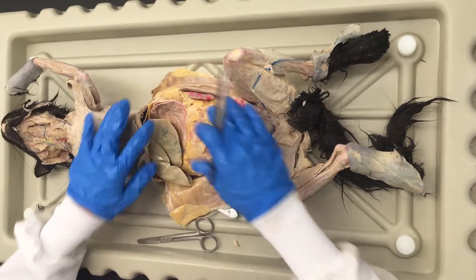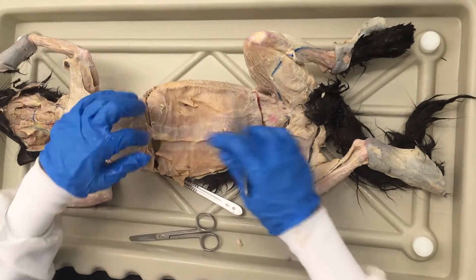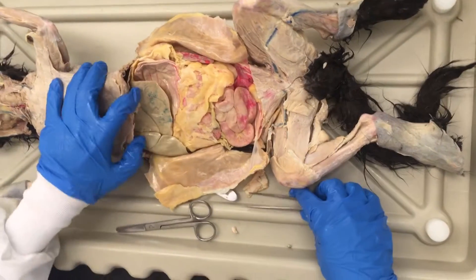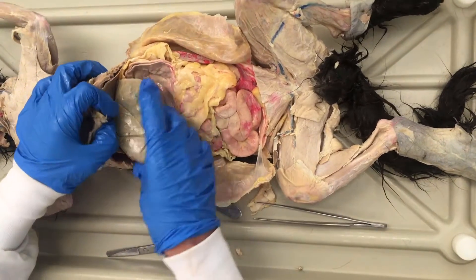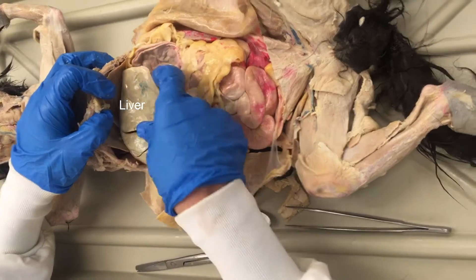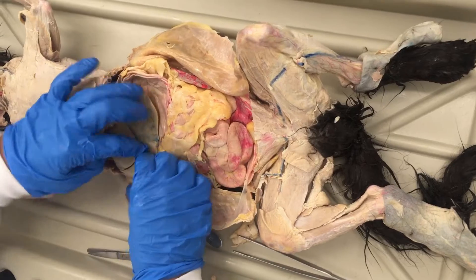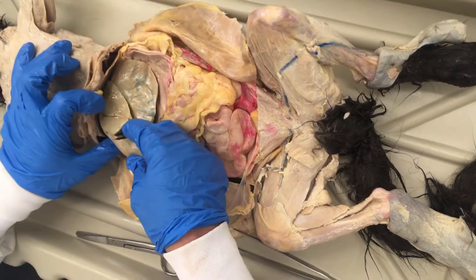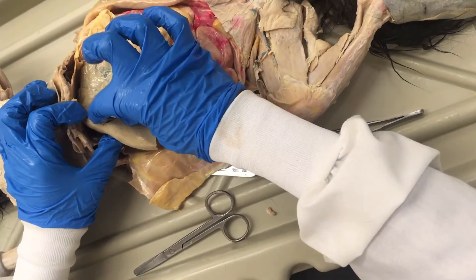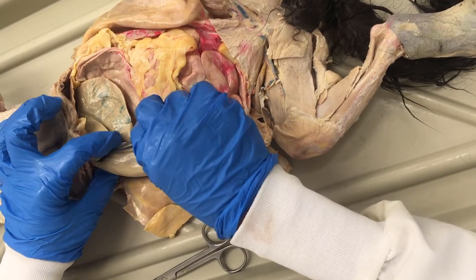Now we have looked into the abdominal cavity. We've made some simple cuts here and you can see some obvious structures. This is the liver, and the liver has a lot of different lobes to it. If you pull apart some lobes, you'll be able to see the gallbladder. I'm pushing apart these two parts of the liver, and you can see this little sac-like structure there — that's the gallbladder.